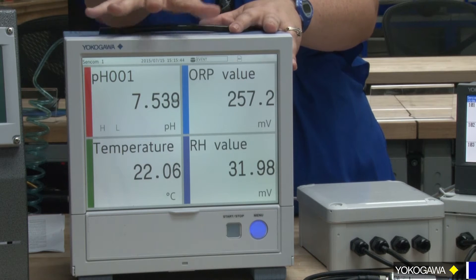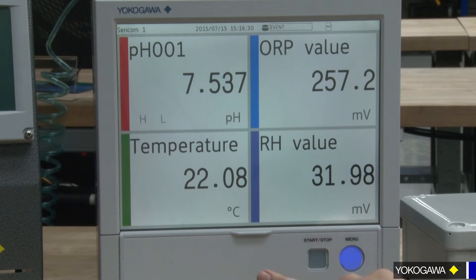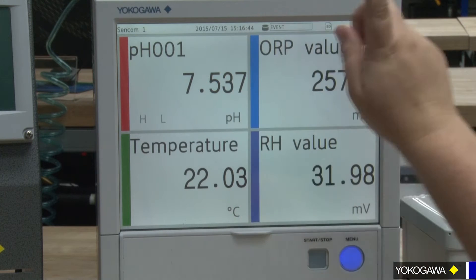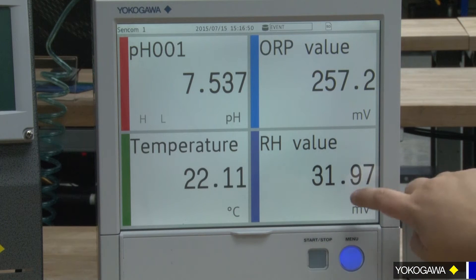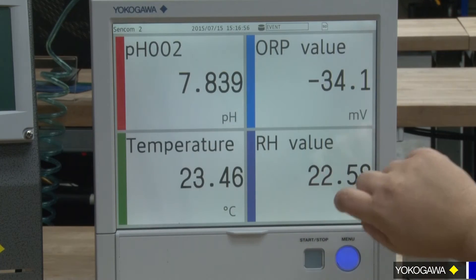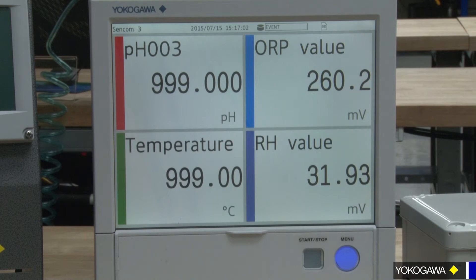Let's look at some of the features in this display. I only have two sensors connected, and we've already pre-programmed it for up to four sensors to be connected. Here we show you a really big screen. You have pH one, your ORP one, your temperature, and your RH — for those of you that don't know what RH is, that's pH-compensated ORP. And if you scroll up, you see pH two, pH three. It's got high values because obviously there's no sensor connected to it right now.